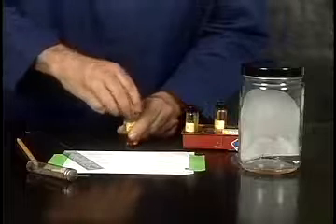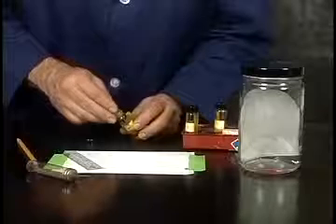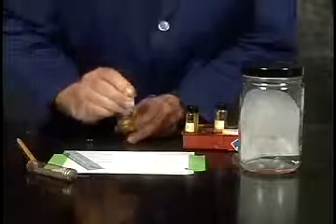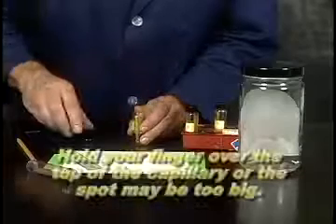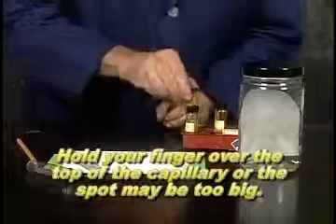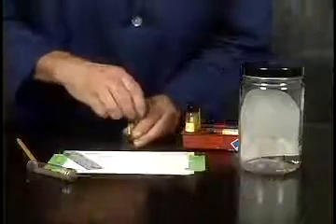To load a sample, let a little bit of the liquid travel up the micro capillary. It's important to hold your finger over the end and then apply the spot right at the origin line. Here I'm using the line on an index card to indicate the origin point on the plate. It's a good idea to begin by practicing with a practice plate before actually spotting.